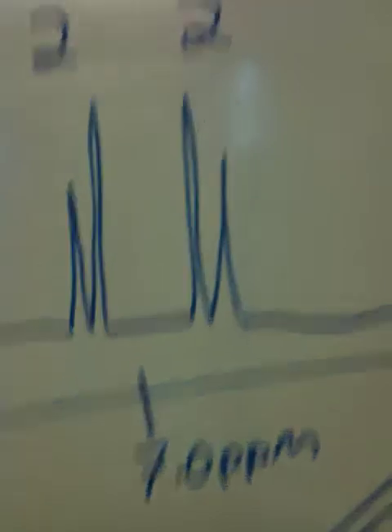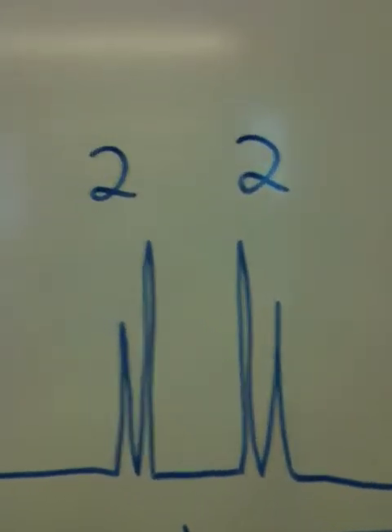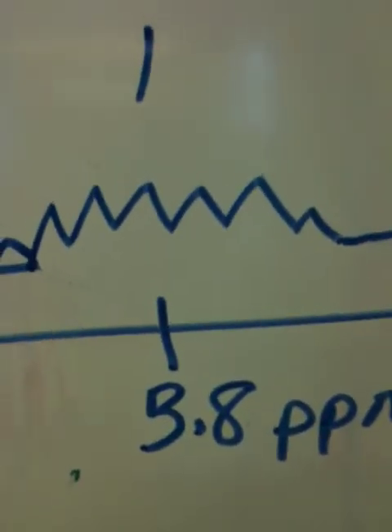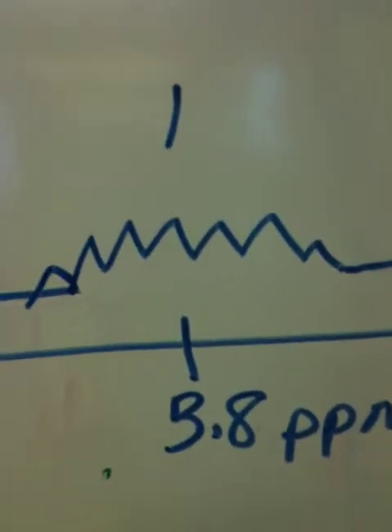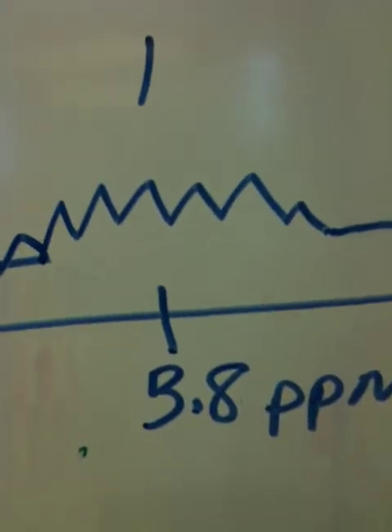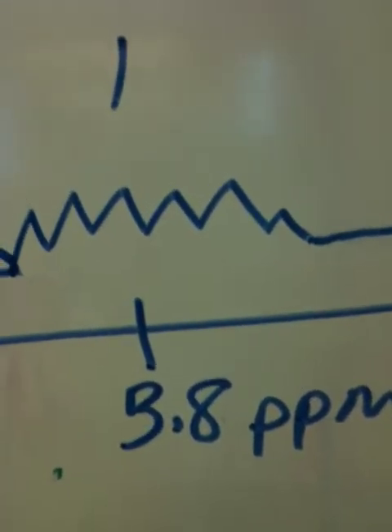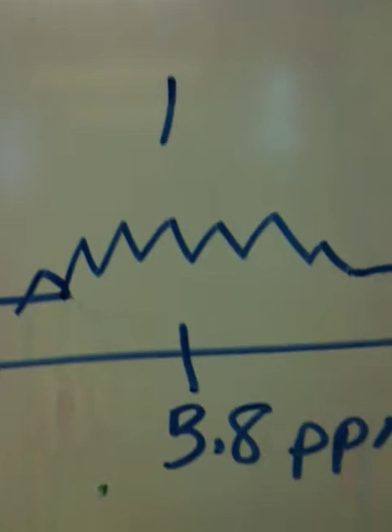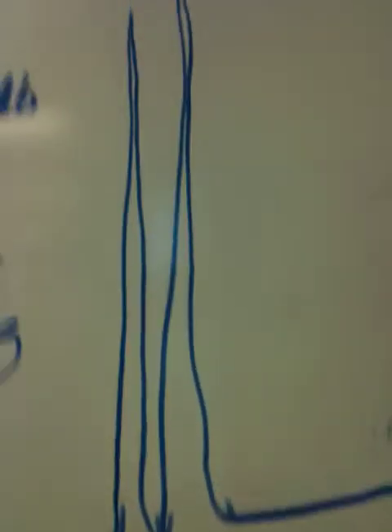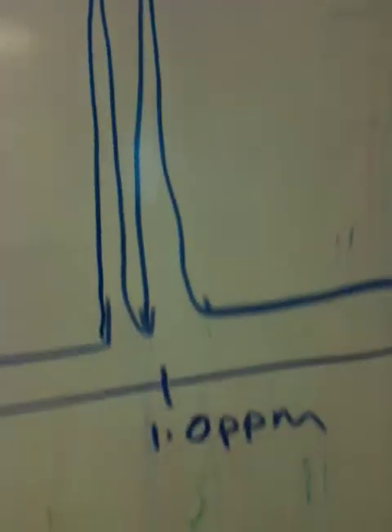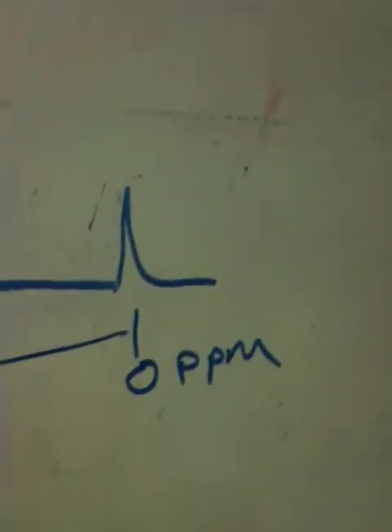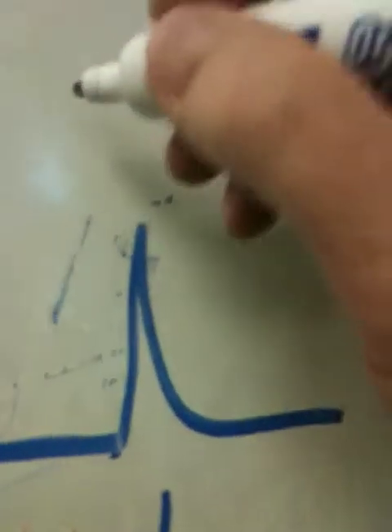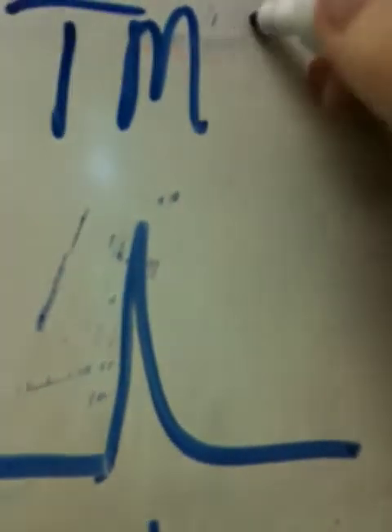Around 7 parts per million we have 2 doublets each integrating to 2. Around 3.8 parts per million we have a rather nasty looking multiplet — just call them multiplets, don't try to over-interpret them; it just means we have 1 near many. At 1 part per million we have a big doublet that has an area of 6. Then we have the reference compound, TMS, tetramethylsilane.